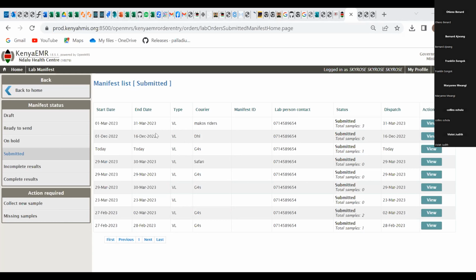It is not required for any other lab. So if your system is configured for the labware, then you'll be able to enter the shipping ID. But if you are using the CHAI as your endpoint, then you don't need it. So that's why for this instance, it comes up as null, because I think Marianne was set for CHAI. Yeah, I think that's pretty much the questions I could see.